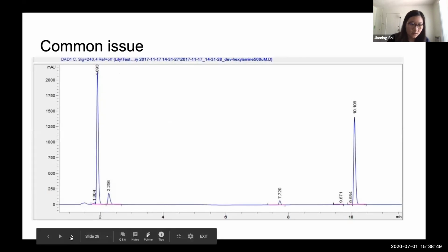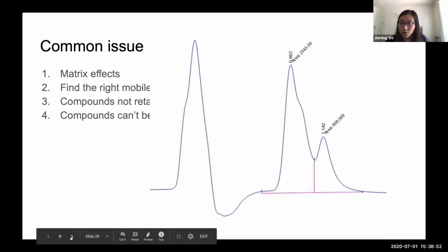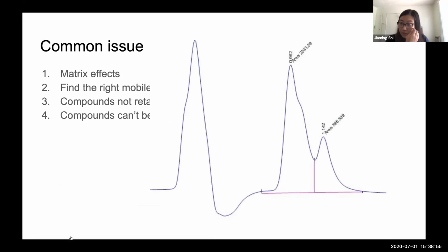But sometimes it will look like this. So that will be 2 peaks merging into one. That's usually going to give you a hard time getting a very precise result. So if the separation is not very good, you're getting a merged peak looking like this. You can probably get away with it by changing your mobile phase ratio and flow rate, but sometimes you just don't have any luck and the two compounds are just chemically too close to each other and the separation just can't be done.